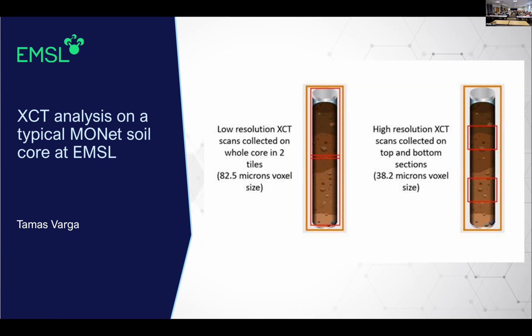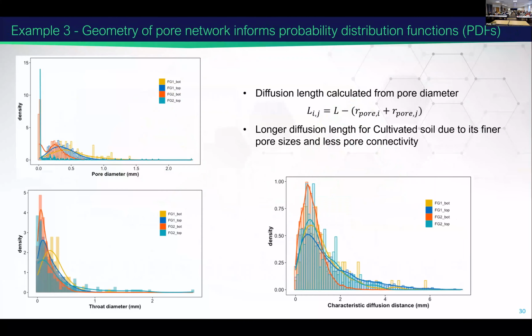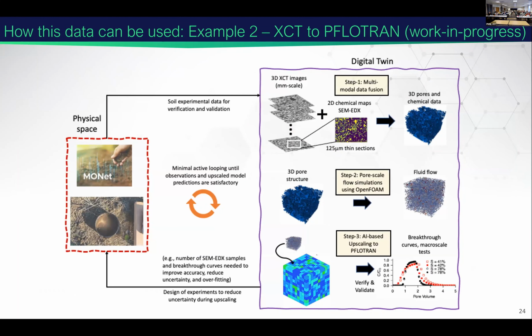I have a question for Maruti. Yes. So Maruti, have you been able to replicate those breakthrough curves that you showed on the right using your digital twin soil? Oh, so that part of the workflow, I still did not match with the exact data yet. That's the ultimate goal. That part of the step is using synthetic data, through a Dask part. So I was able to do that, but that's 2 years down the lane.